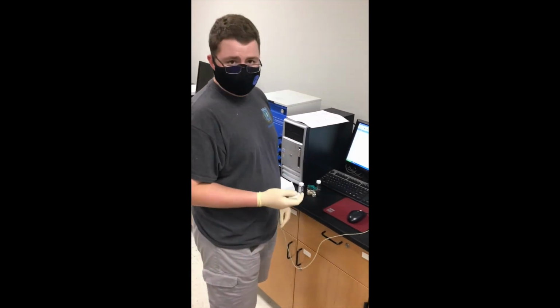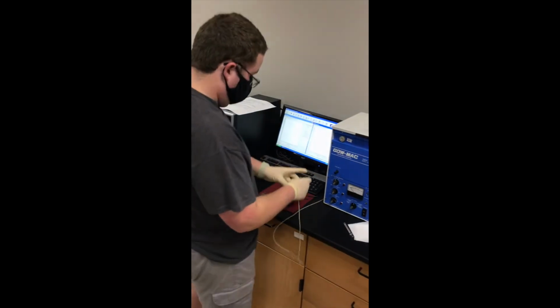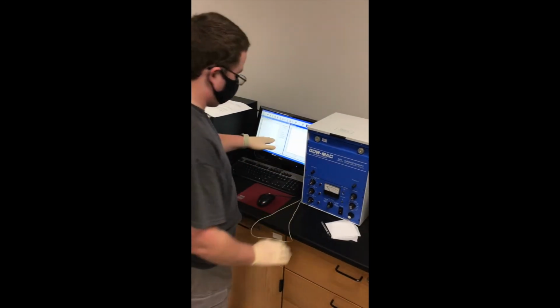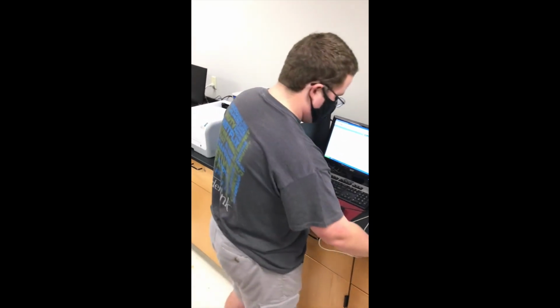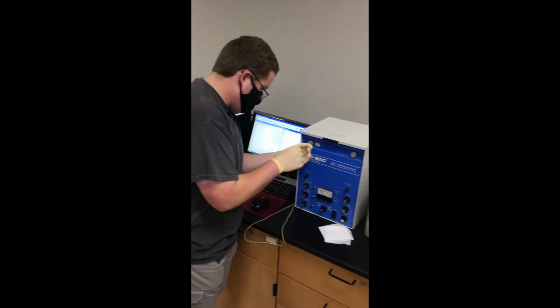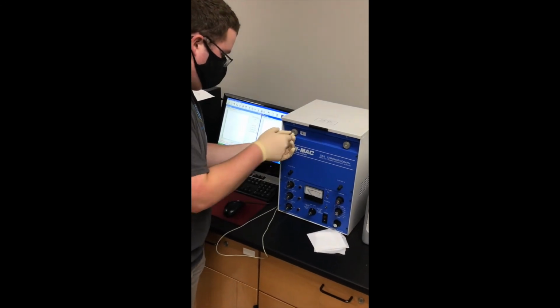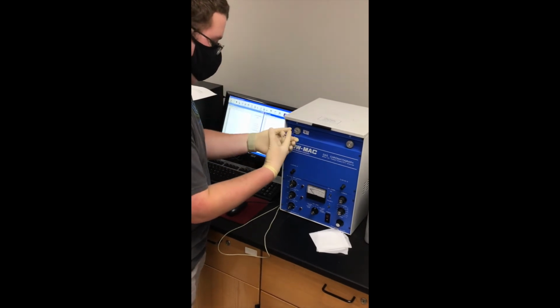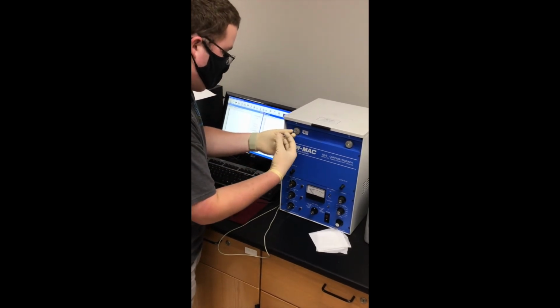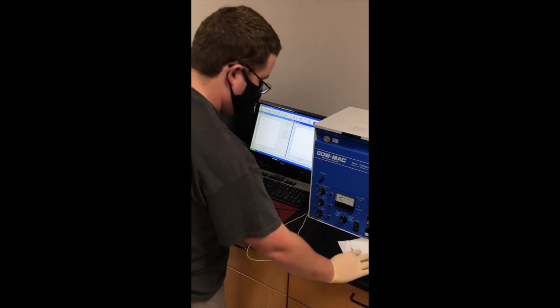Normally people say 1, 2, 3, push, and push it at the same time. But the important thing is that this starts recording at the same time that it is injected. Otherwise your timing is going to be off. So, like we said a second ago, we would have had this here, ready to inject something, and then somebody standing off to the side with this. We'd say 1, 2, 3. They'd press the button, and then we'd also push all of the fluid inside into the GC, and then draw this back out, and then just leave it.